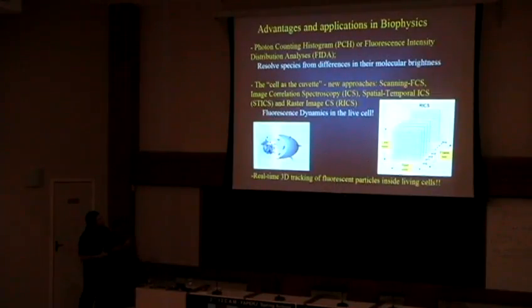That is, since you have in a confocal microscope what we do, we have that point, that observation volume in the cell, we scan it, and we get an image. That means we have data from each point in that plane of the cell. So we can recover dynamic information from that images. Actually, we have different time frames for a set from a sequence of images that we can use to calculate correlations. We have the time interval between pixels, that will be very short, time interval between lines, that will be in the order of milliseconds, and the time difference between frames.